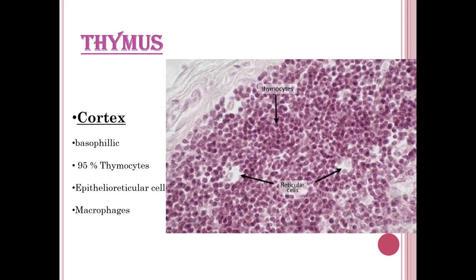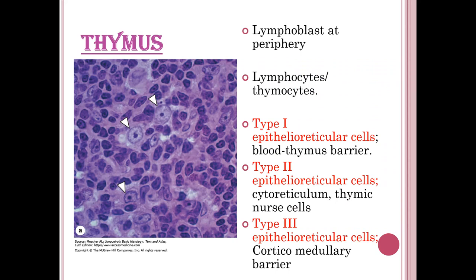The cortex is visible with basophilic dye. Thymocyte cells occupy approximately 95% of the thymus gland area. Epithelial reticular cells and macrophages are also present. Lymphoblasts are situated at the periphery. Type 1 epithelial reticular cells form the blood-thymus barrier. Type 2 epithelial reticular cells form the cytoreticulum and act as thymic nurse cells.